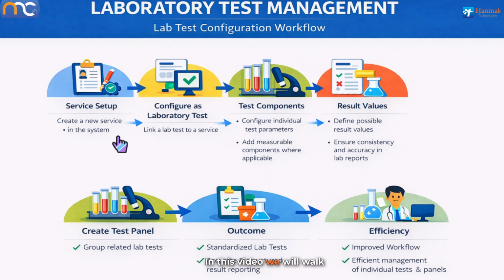In this video, we will walk you through the complete lab test configuration workflow. You will learn how to move step by step from creating a service to setting up a lab test, configuring its components, and finally organizing multiple tests into a panel for streamlined use.